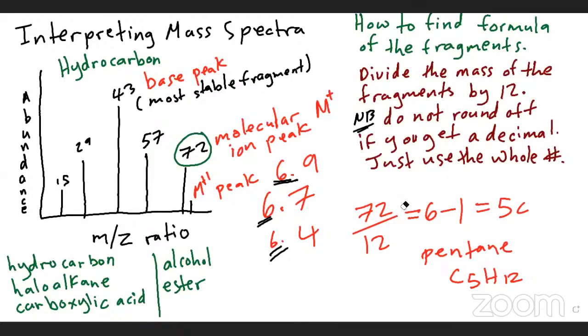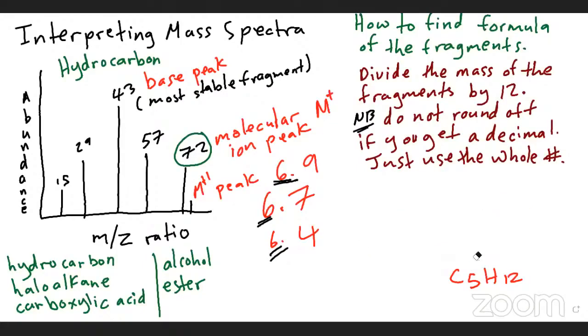All right, so if you remember with the molecular ion, we would divide by 12. Whatever answer we get, we subtract 1 from it. With the fragment, it's different, just a little different.